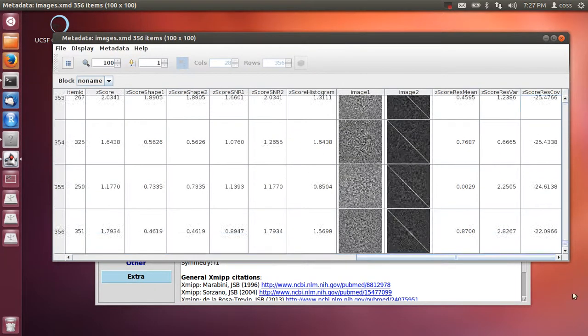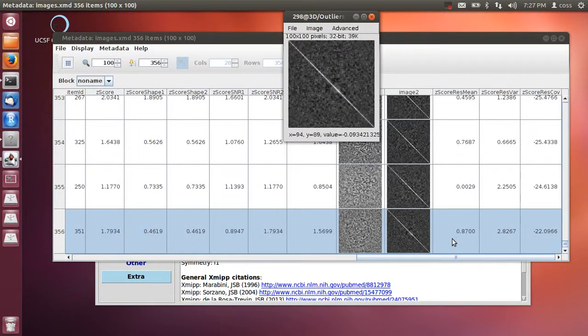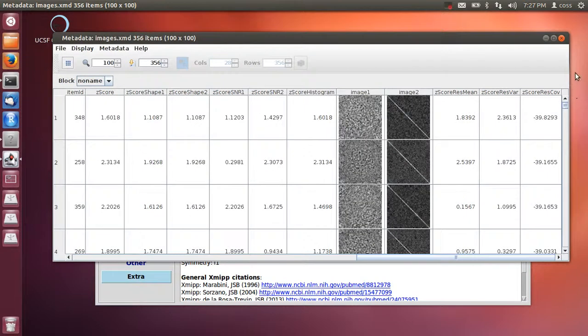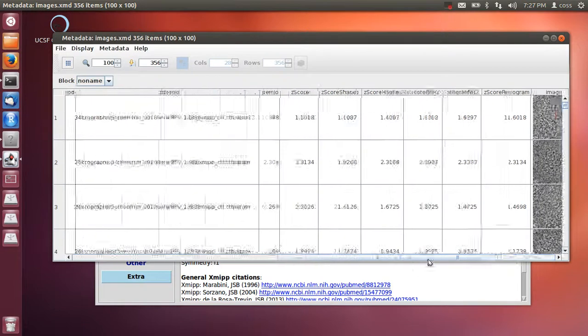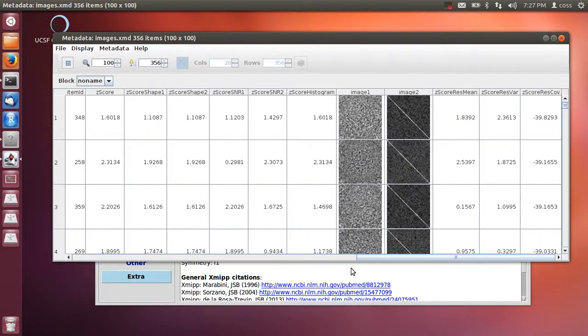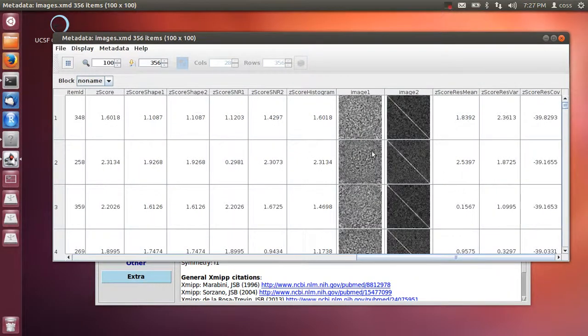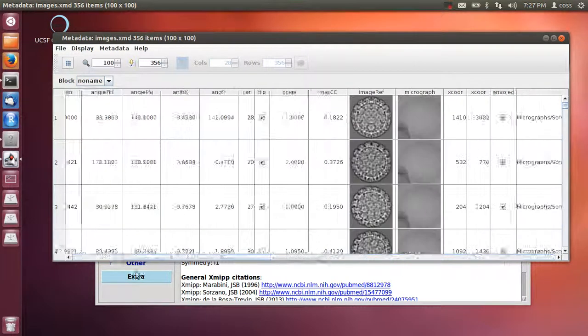For instance, here we can see that there is some structure in the covariance matrix, meaning that the covariance is not totally white noise or color noise like the rest of the images here. So ideally you should not see any structure in this residual. This is the experimental image, and these are the residuals. You shouldn't see any structure in there.